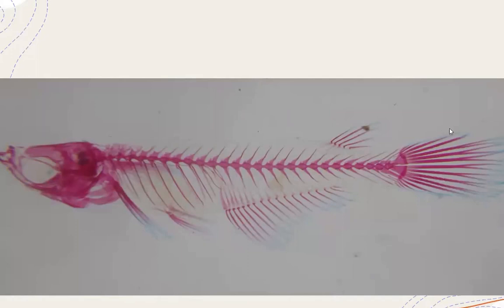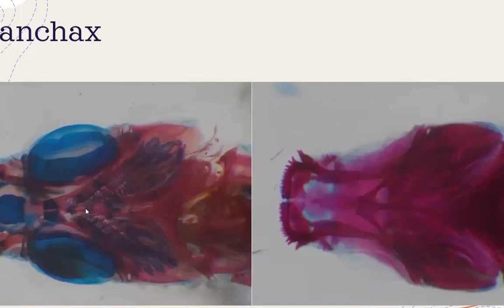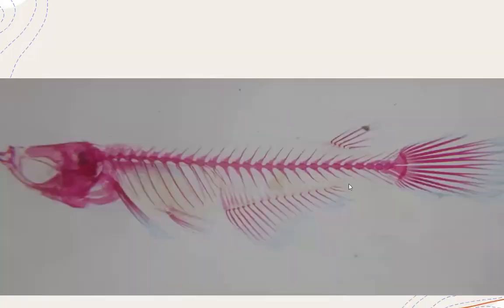And this one, sometimes I put it for the same thing as this one. I cannot stain the cartilage bone with Alcian blue, because sometimes I have a problem with the Alcian blue. When we order or buy Alcian blue, we should use it immediately, or maybe within a month. Maybe the quality of them, the temperature or something can destroy them. It's not so good.